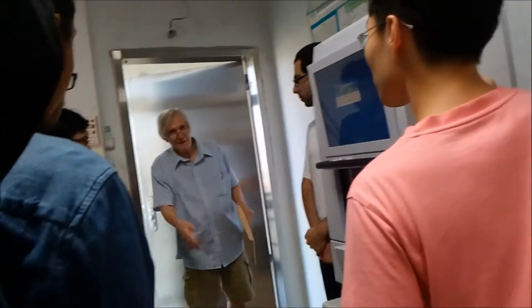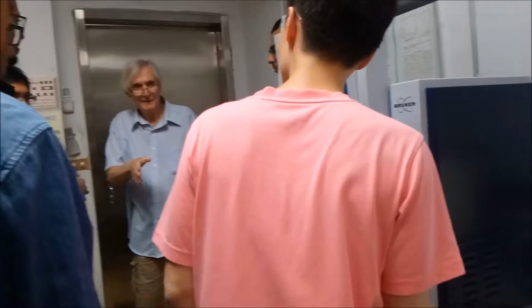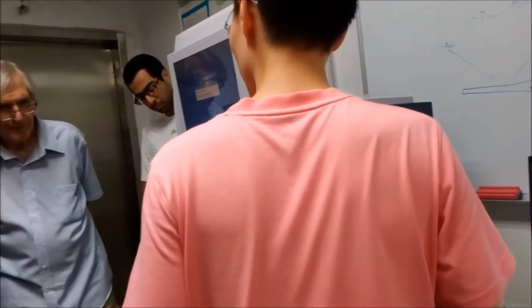Okay, you can open it, yeah? Really? No, I mean, since there is a running experiment, you can interrupt it, yeah? Yeah. Okay. And this is our sample. Okay. And this is silicon. Silicon powder, yeah.